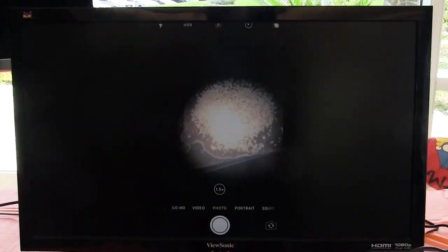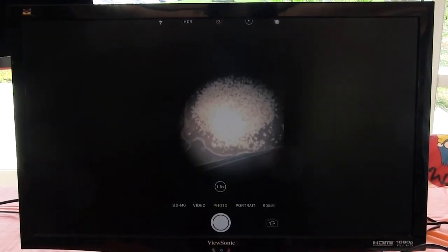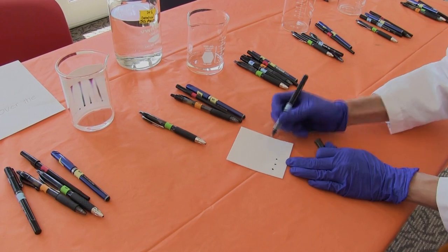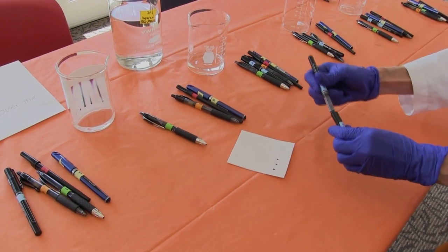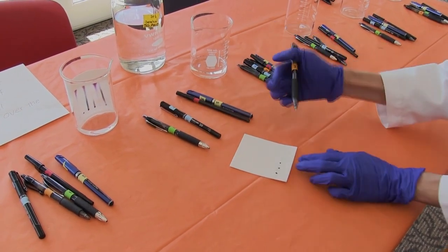We've rounded up five suspects who all had some food on their clothing, so we've sampled the food on their clothing and we're going to compare it to the crumbs that were found at the scene of the crime using microscopy.